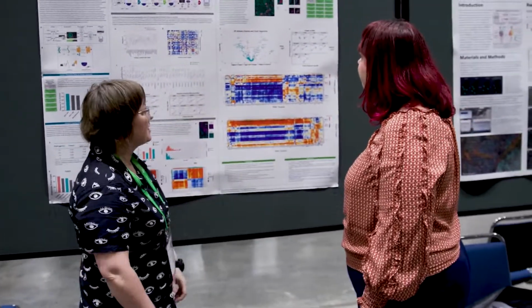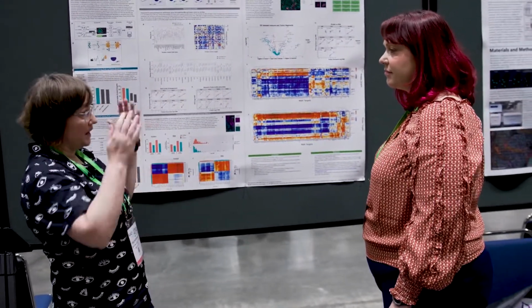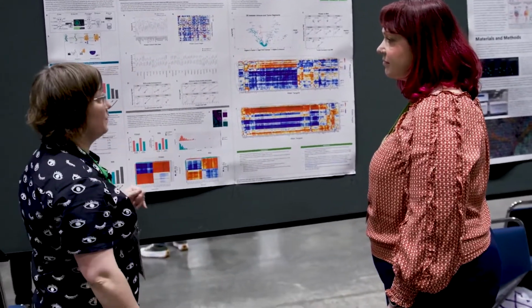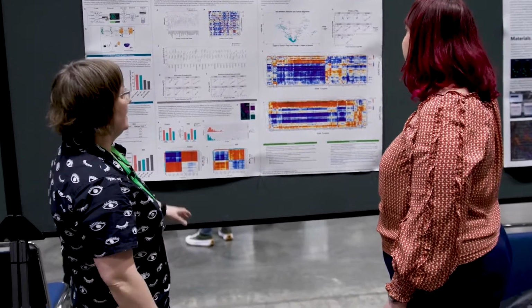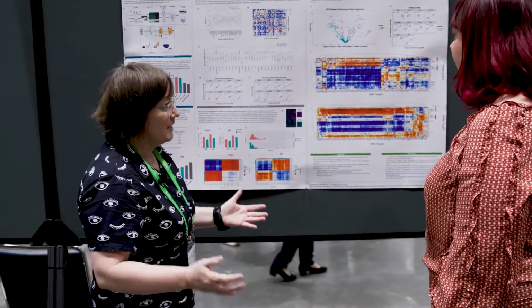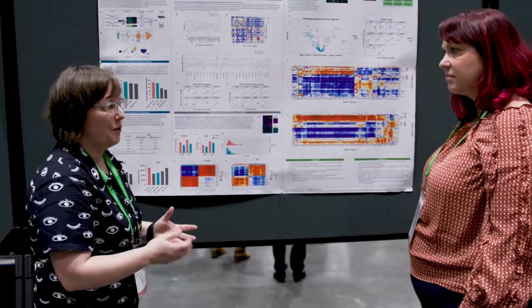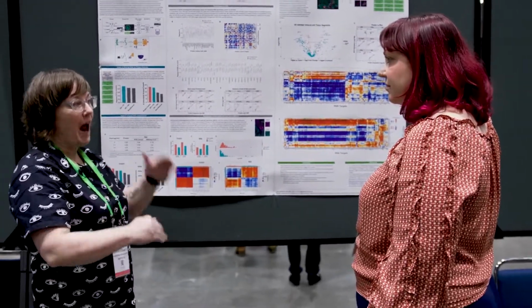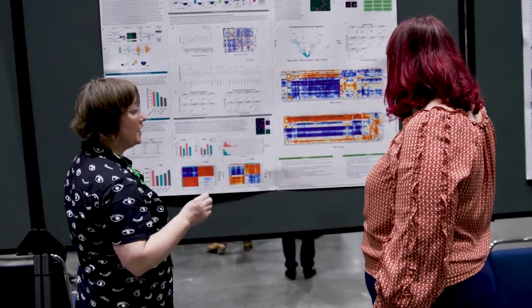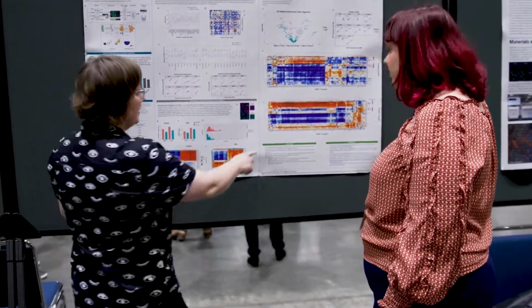Then we went ahead and masked and collected for our immune. And so this plot allows us to look at the differential expression of targets within the two segments for both RNA, which is the cyan, and protein, which is the pinkish color. And then again, evaluating the correlation. And here, it's beyond how analytes correlate, but how other targets track with one another, what's going on. And so these two heat plots allow us to see how certain protein targets, which are listed on the y-axis, track with RNA targets.